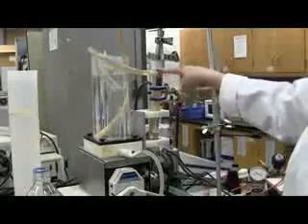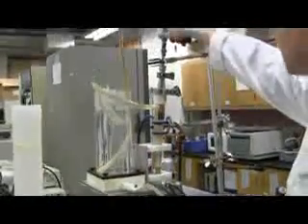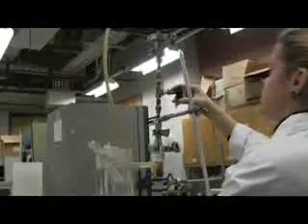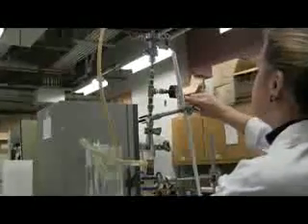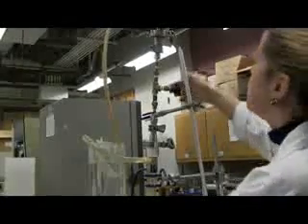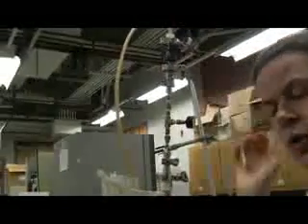Then we go through the membrane, and then over here, which you can't quite see, I'll just mention that there's a pressure gauge, in PSI, and you can just read the PSI right off the gauge. And then up here is another valve.